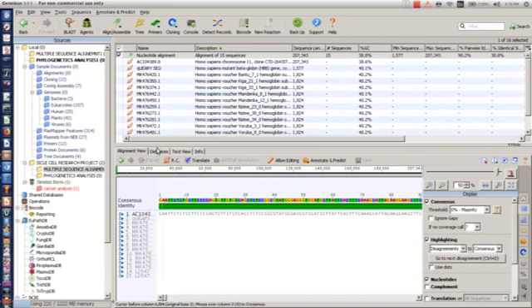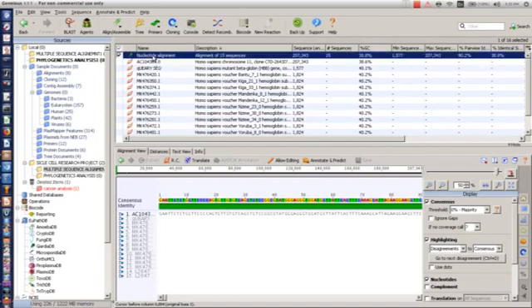The next thing you are to move on to is to build your tree. And if you are building a phylogenetic tree, that means you are running your phylogenetic analysis. So don't forget, I told you that you cannot run phylogenetic analysis until you have done multiple sequence analysis. Since we have already done our multiple sequence analysis, we can actually build our tree. So the building of the tree is actually the phylogenetic analysis.